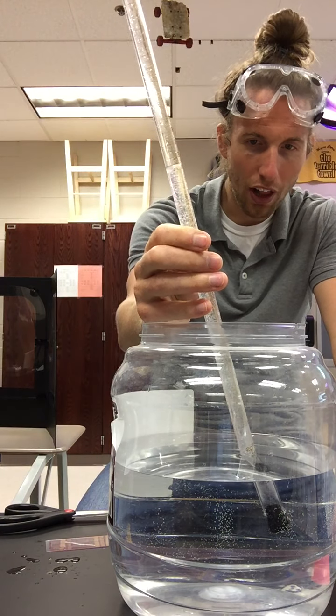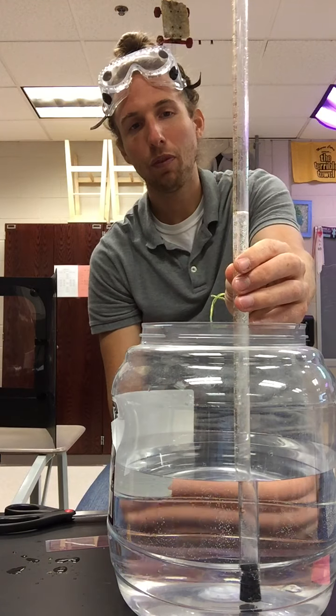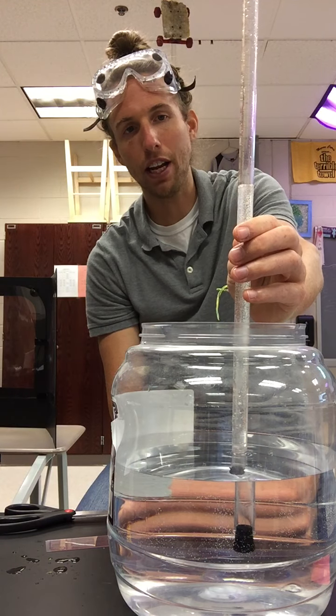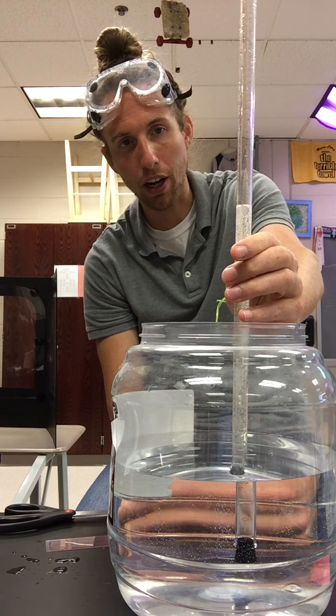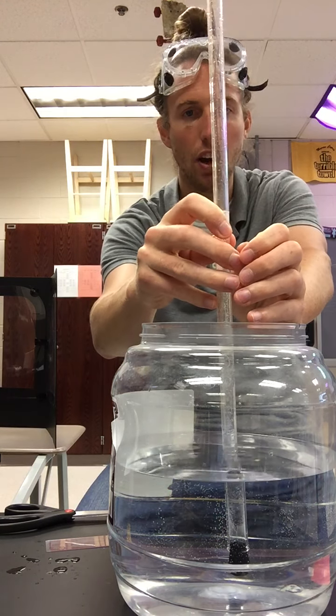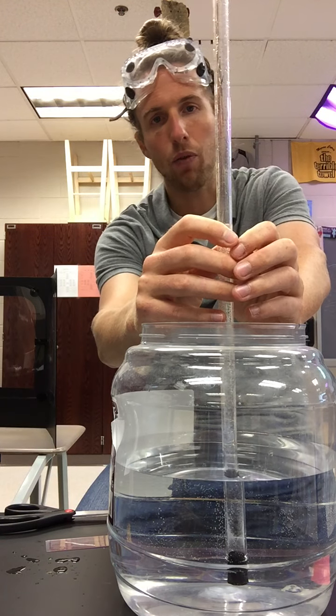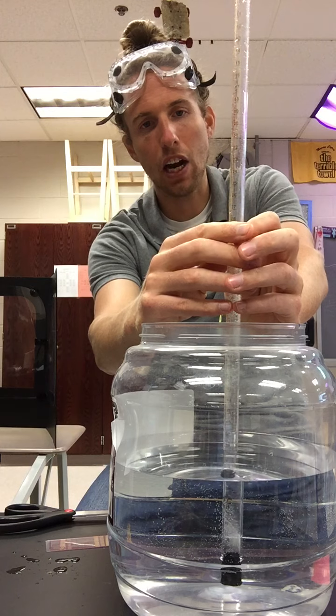And good news for all of us, it looks like the magnesium has been consumed. We had to let it go for quite a while. As we take a look at our eudiometer here, we can try to figure out exactly how much gas we have given off. Okay, so we can read the eudiometer. It's hard for you to see there at home.